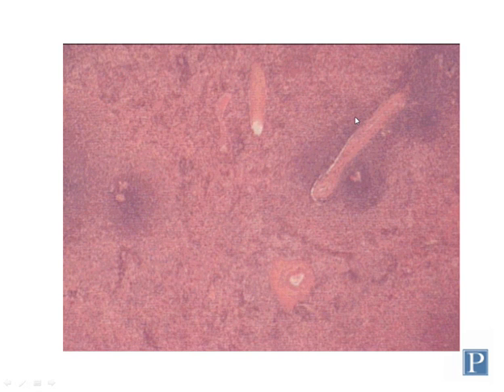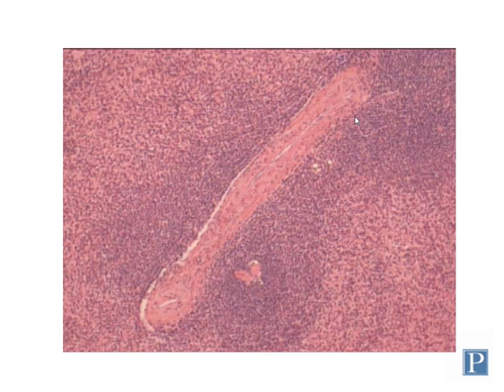Again, the cells are histologically indistinguishable based on coloration or morphology, but you can tell them apart depending on how they are arranged. Here's a higher magnification view of the central artery. This region of cells forming a sheath along either side of it is the PALS, composed of T cells. But notice here is a nodular cluster of B cells which is sort of fused with the periarterial lymphatic sheath.